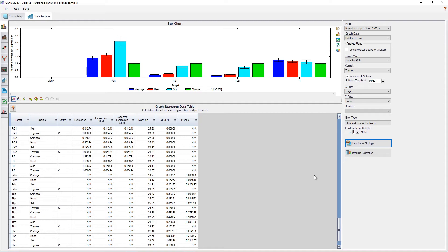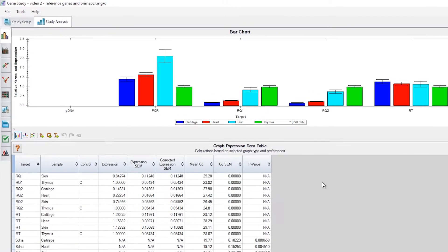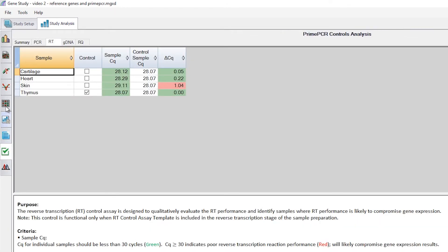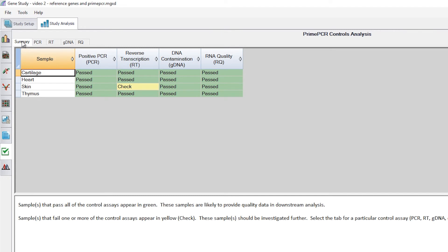To view the results from the tool, just click on the icon for PrimePCR Controls Analysis on the left sidebar, which looks like a check mark. When the tool is opened, we first see a summary screen showing our results. In this case, we ran four different samples — cartilage, heart, skin, and thymus — and ran controls for each: a positive PCR, a check for reverse transcription, a check for genomic DNA contamination, and an RNA quality check. We can see that all controls show a result of pass, save one.